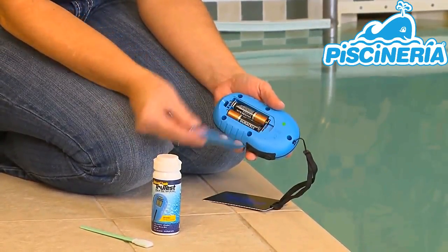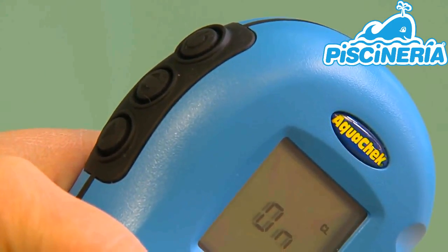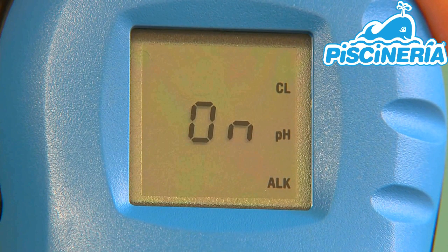First, after inserting two AA batteries, turn the reader on by pressing the top black button on the left-hand side of the reader. You will notice a 2.2, which illustrates the version of reader you are using. Next, the word ON appears, indicating the reader is ready for testing.